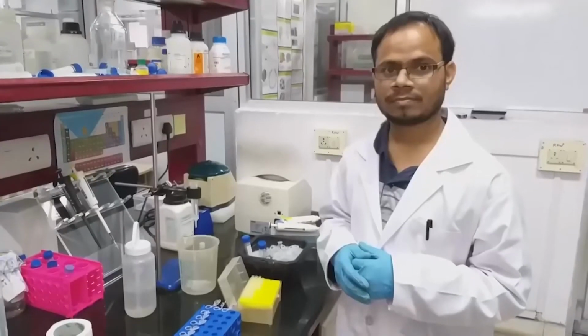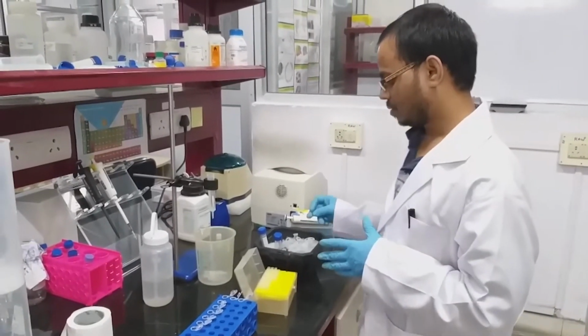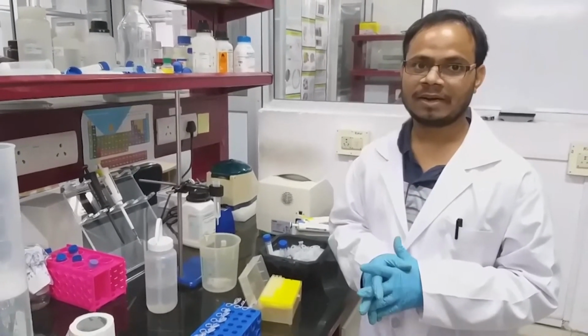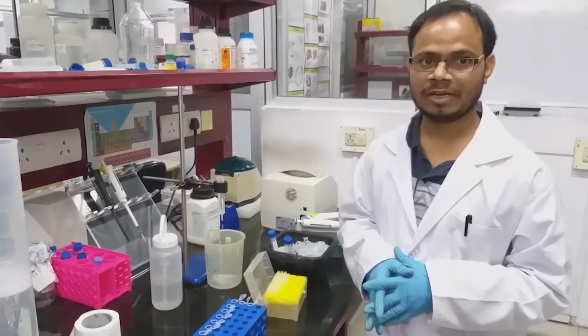While the washing is going on, we have to take 50 microliters of each fraction and run it on SDS-PAGE. That will give the purity of the fractions.